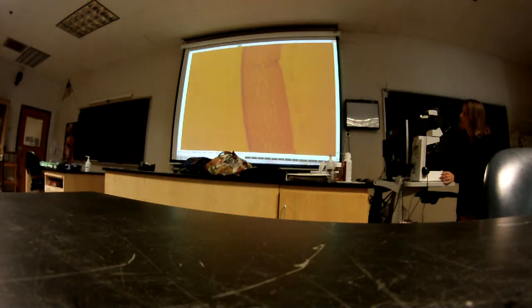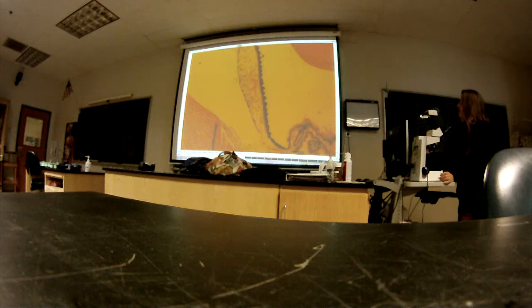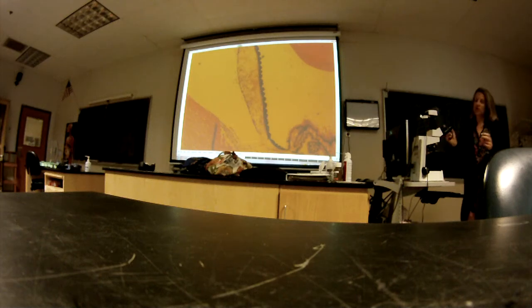Okay, and there's a space. If we move posteriorly, there's a space located between the cornea and the lens, and it also includes the space down in here. What is this? Anterior chamber. Not chamber, chamber has a slightly different meaning. Anterior cavity. This is the anterior cavity. It includes both of these. In your book, it divides it up into chambers.